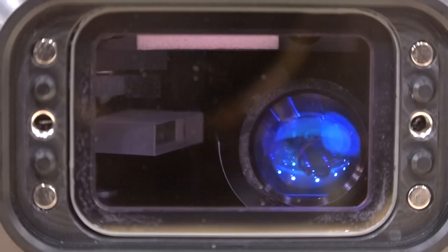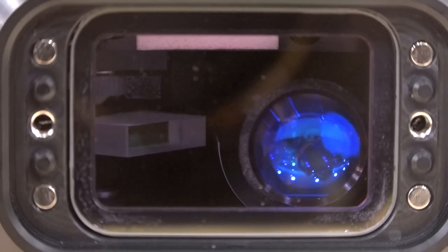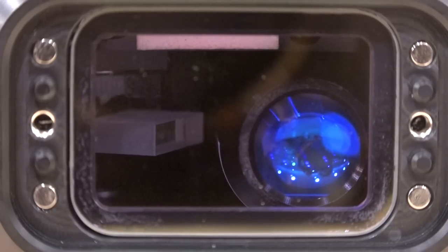Here's a close-up of the aperture — you can see the collection lens on the right side and the laser aperture on the left. In SORS mode, this instrument needs to change the angle of the incident laser, so there are some moving parts inside. Running a diagnostic shows that moving part — which is precisely controlled and tracked. The instrument tells you very accurately the exact location of that moving element in order to do the computation to tell what's inside the container versus the container itself.